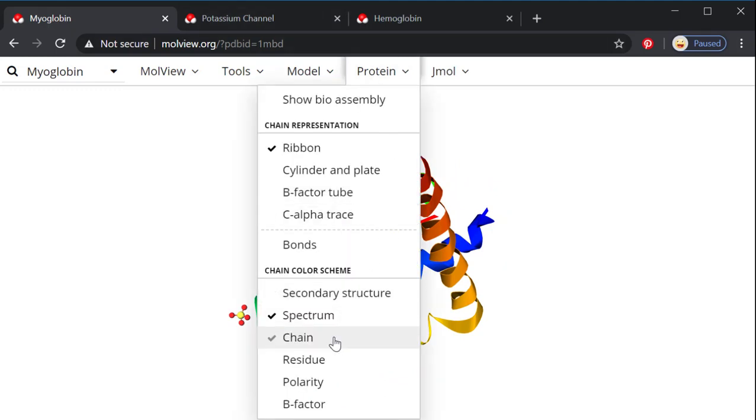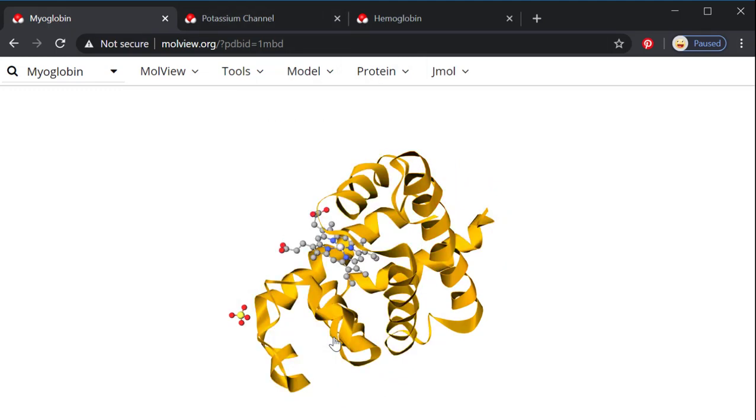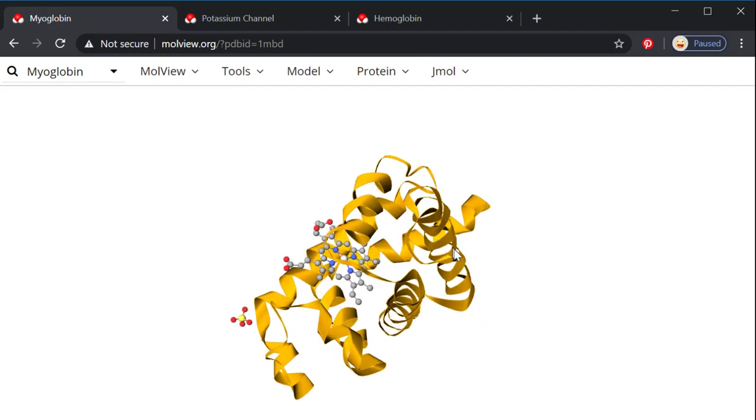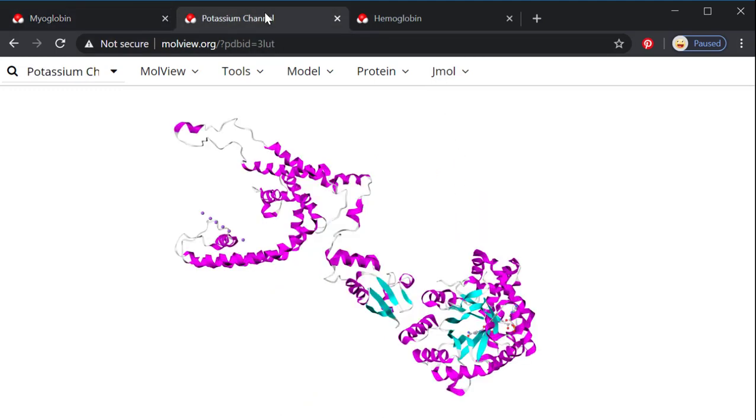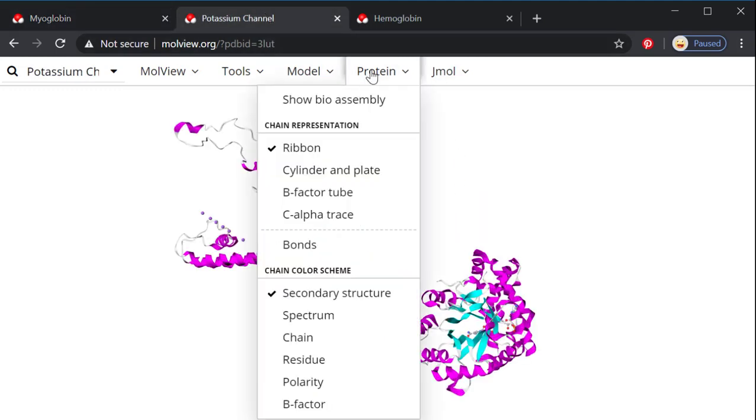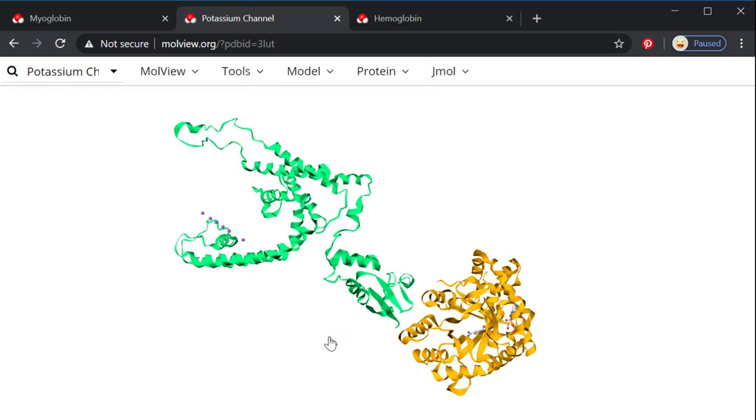Continuing, I can also color by chain. So if I color by chain, if this is all yellow, that means that if I unraveled this, I would have one yellow polypeptide. And to see the contrast of that, here's the potassium. And if I color it by chain, now I can see that there's two subunits to this protein.